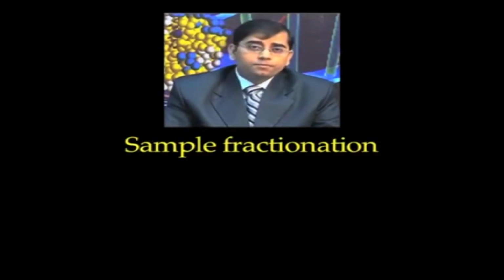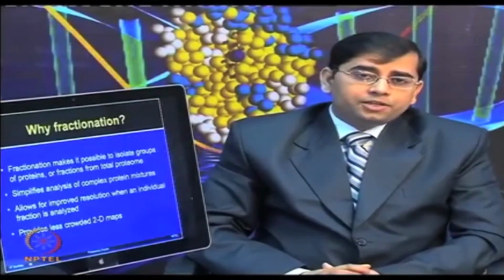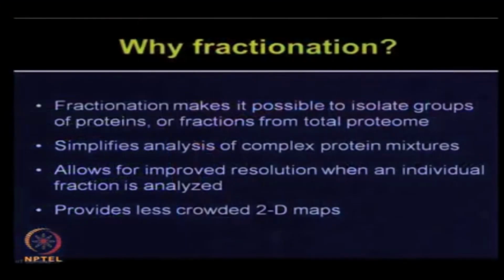Or if you are looking for wide proteome coverage, but the proteome poses a challenge in separating all the protein mixture simultaneously, then one needs to do fractionation to reduce the complexity of the sample. So, why perform fractionation? Sample fractionation makes it possible to isolate a group of proteins or fractions from a given total proteome. By doing fractionation, you can simplify the analysis of a complex protein mixture.